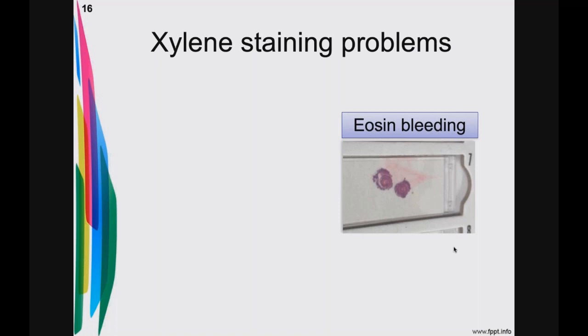Where we have problems with xylene is in staining, at the end, right before cover slipping. The role of xylene at the end is to be a compatible solvent with our mounting media for cover slipping. Now remember, xylene can hold a certain degree of water. One of the problems, especially at this time of year when it's really humid in the Midwest, is that if your final 100 is not 100 because of humidity, you now are going to take that tissue section from 99.9% alcohol into xylene. Well, remember, xylene can hold a certain amount of water, and we take advantage of that on a regular basis. But when that final 100 has too much water, it goes over, and xylene can't hold on to the excess water, but xylene can't displace it.